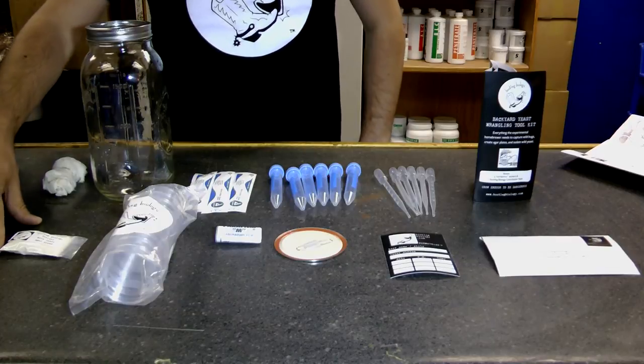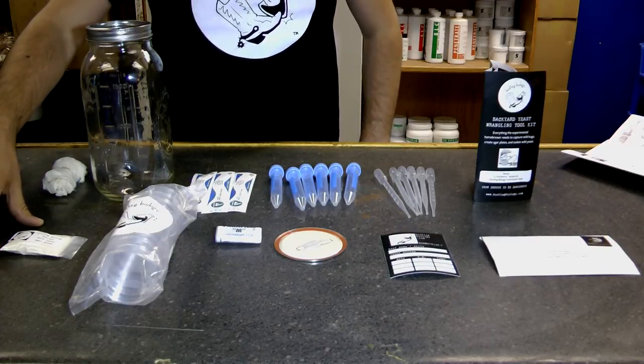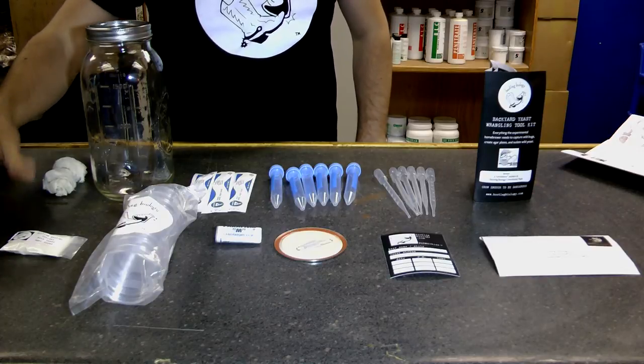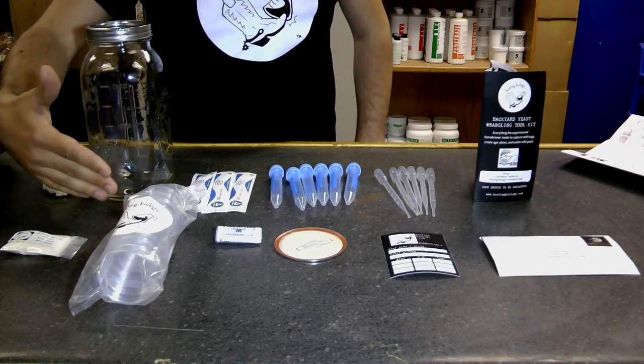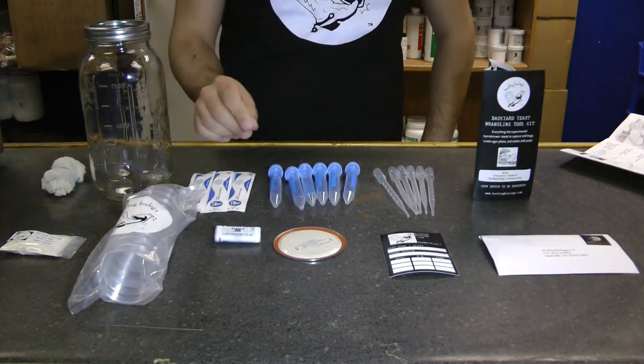This is the Bootleg Biology Special Wild Yeast Agar Blend. You're going to boil that with some water, pour it into sterile petri dishes, then wrap that with some parafilm to seal it. You're going to use those three things to isolate the yeast.